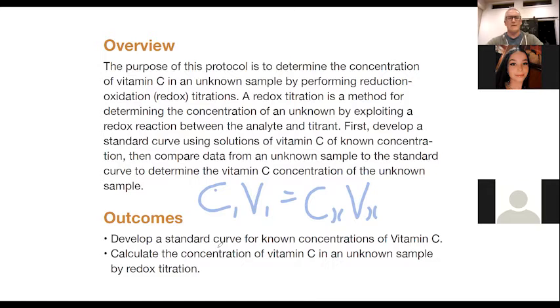It's like in every lab in the world does these routinely. So it's a good thing to know how to do and how to understand how it works. But this is slightly different. This is a unique titration because we're going to be using redox or reduction oxidation. What's a reduction and oxidation reaction?